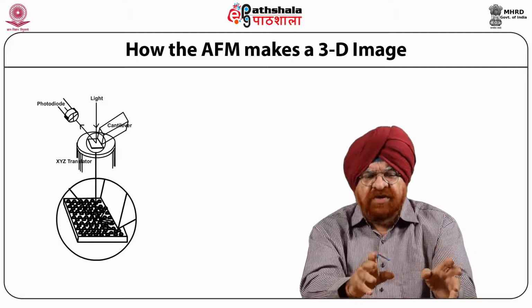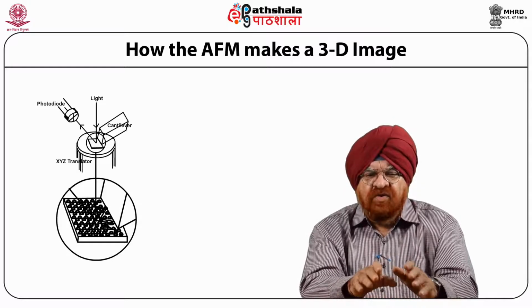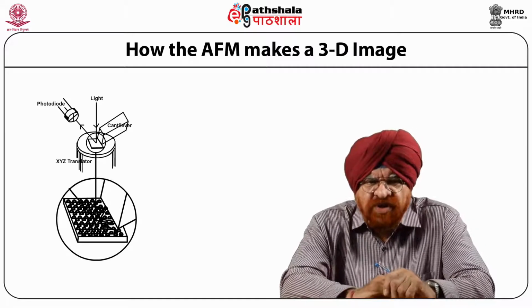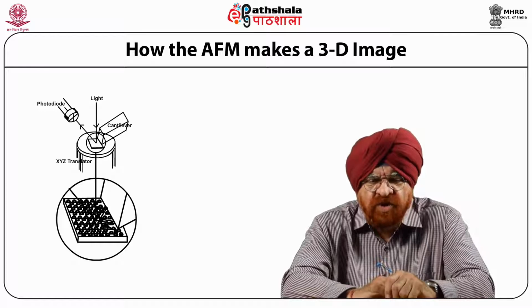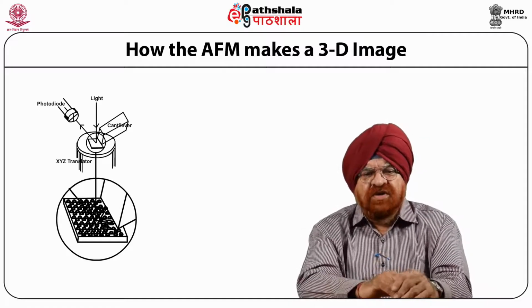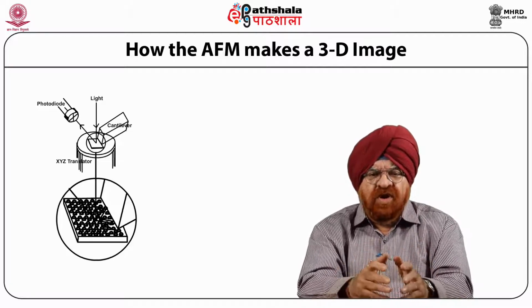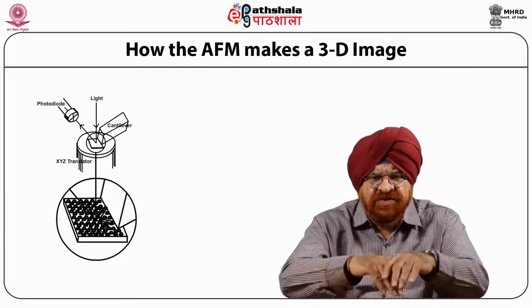Using dual magnification, the AFM combines the wide field view of a scanning electron microscope, SEM, with vertical resolution which exceeds that of transmission electron microscope, that is called TEM, and is very widely used in the area of corrosion research. The ratio of the vertical to horizontal magnification can be very large, 1000 or more, to allow easy detection of differences between very smooth surfaces.